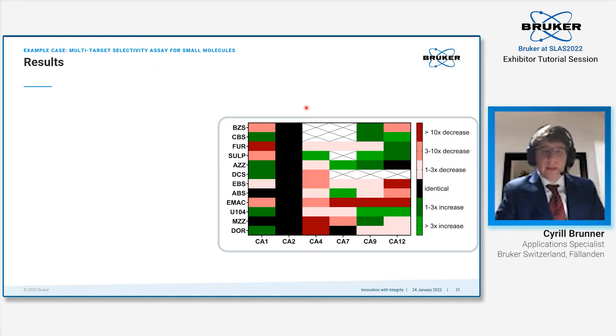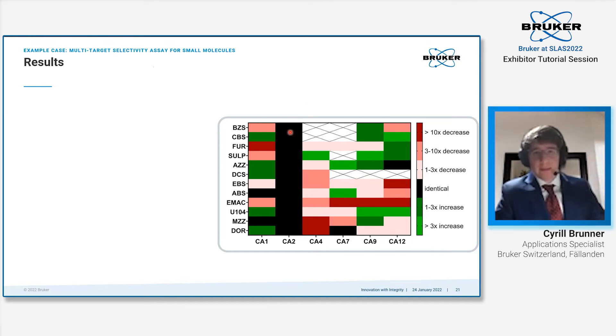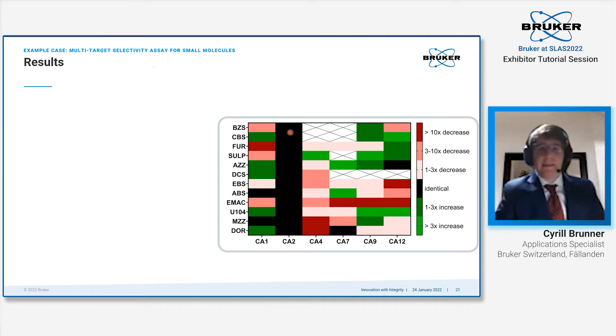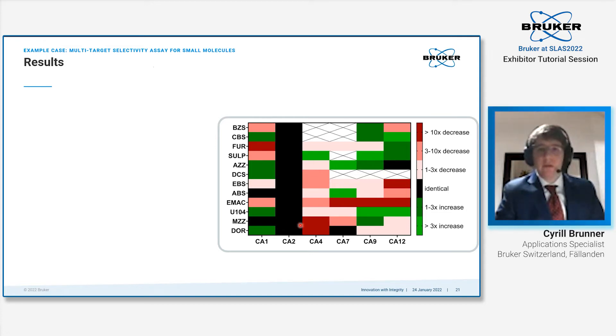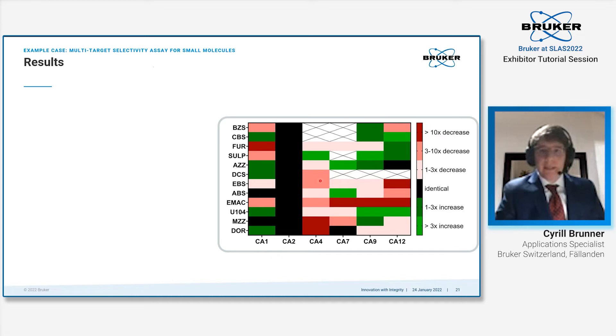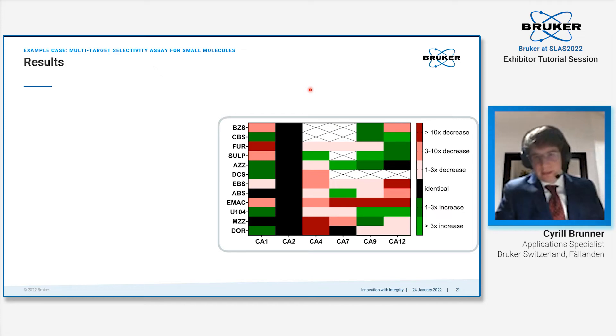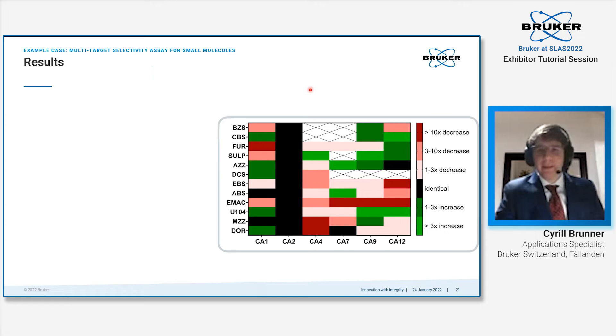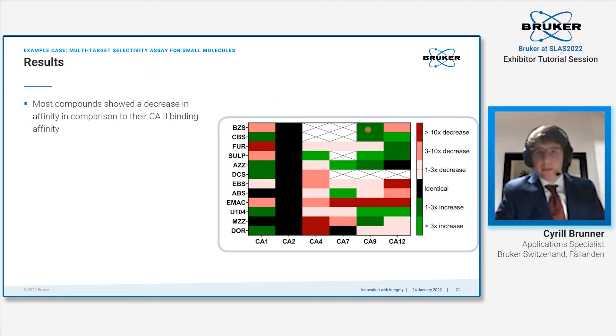We chose carbonic anhydrase 2 as our reference value. We normalized each obtained affinity value against the KD value obtained for carbonic anhydrase and generated this heat map. In the heat map, black means you have an identical value between the reference CA2 and whatever else protein. Green means increase in affinity, so affinity gets better. Red means a decrease in affinity. White blank space means that no binding could be detected. If you look at this graphic, there's more white and also more red than green, indicating that most compounds had a decrease in affinity for the other proteins in comparison to CA2 binding.